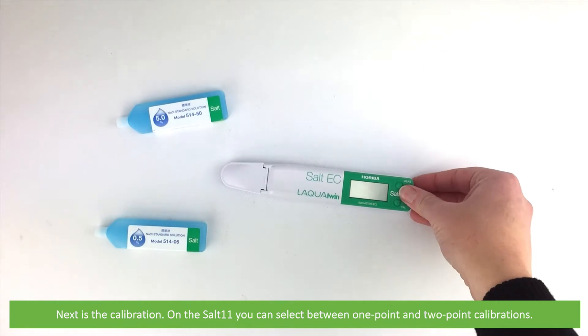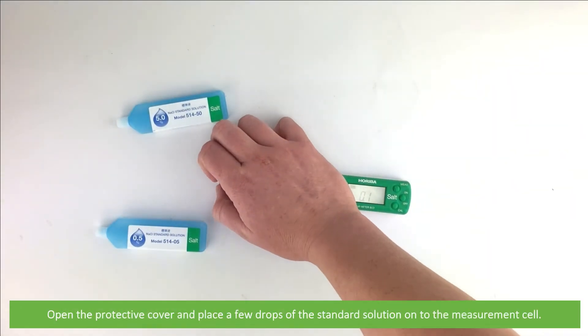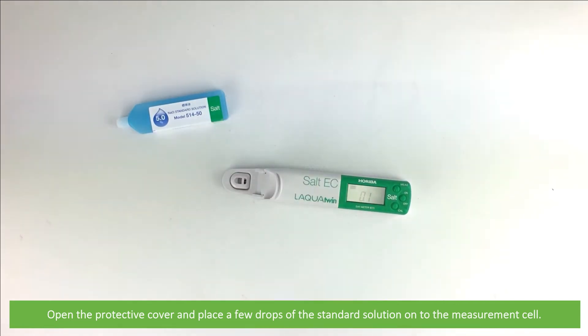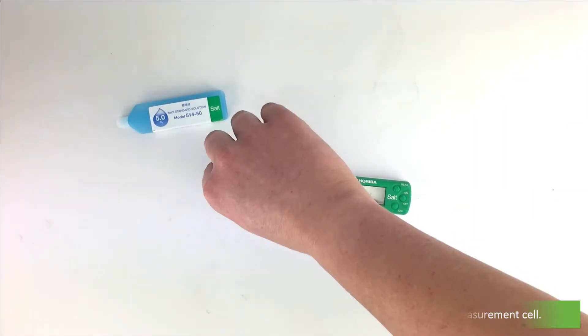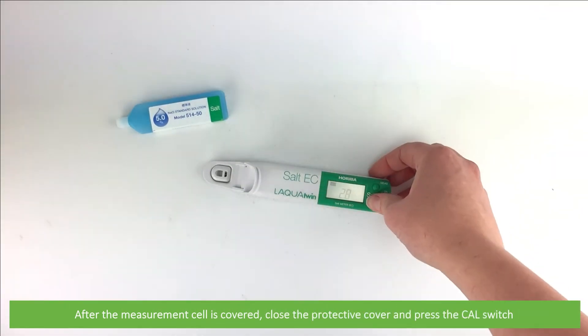Next is the calibration. On the Salt 11, you can select between one and two point calibration. Open the protective cover and place a few drops of the standard solution onto the measurement cell. After the measurement cell is covered, close the protective cover and press the Cal switch.